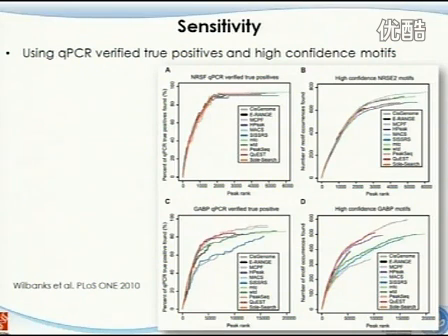And this one starts to separate a little bit. So you can see this is 11 different algorithms. This is the GABP. So for some of the algorithms, once you go to 5,000, you get about 80% of the experimentally validated ones identified. But sometimes at the same number of reads, you get only 55% identified. So this really gives you the sensitivity of different approaches.